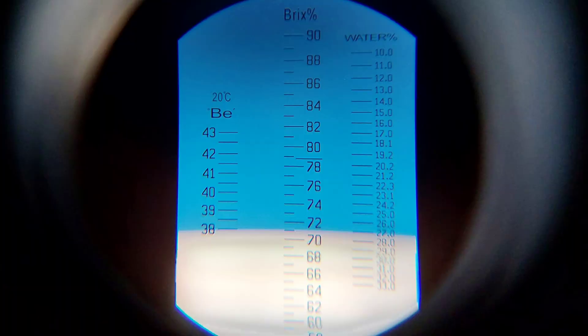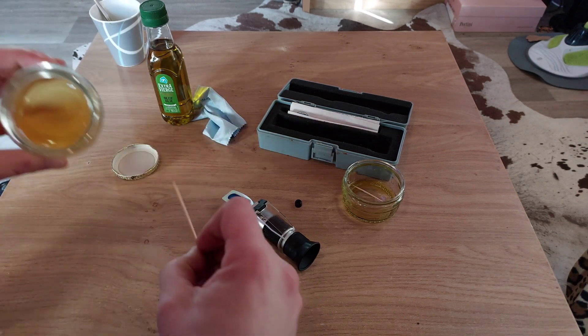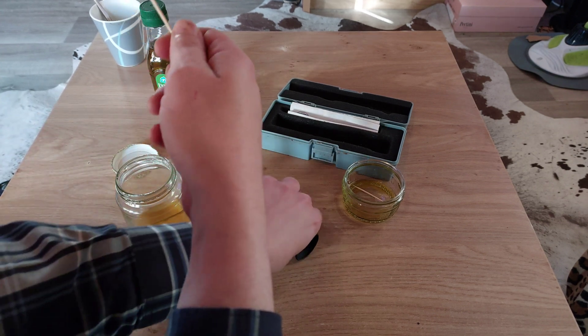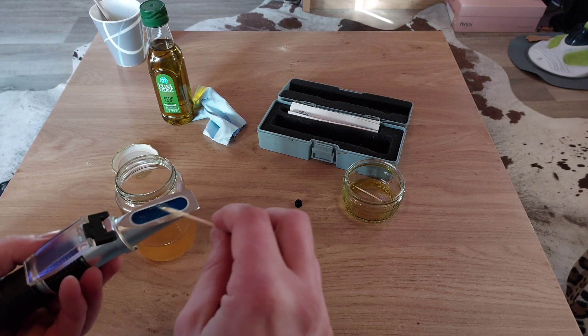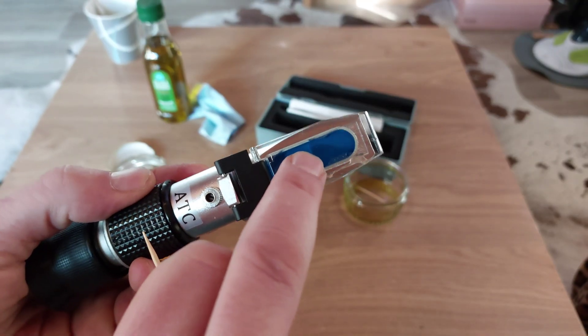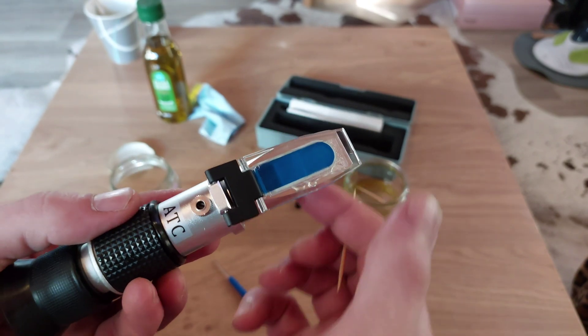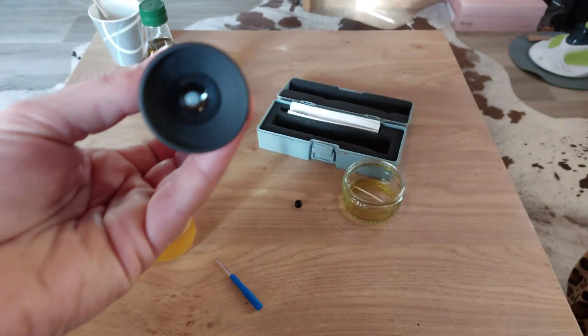Let's clean up the prism and put some honey on it to test it. We'll take some honey, just the same as with the olive oil — get it on the prism. Close the prism and push gently to get the air out. You should see something like that, and it's time to measure.